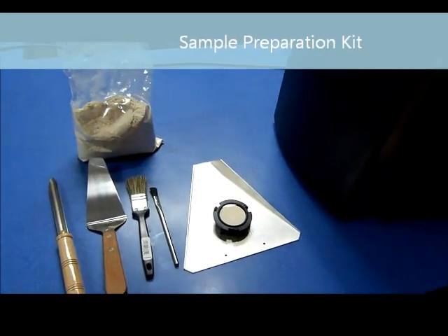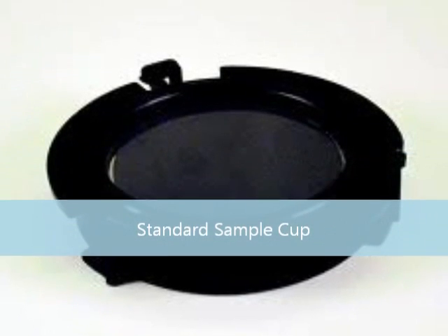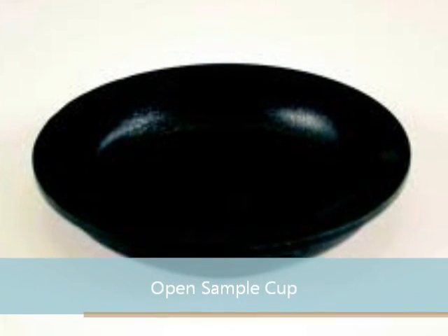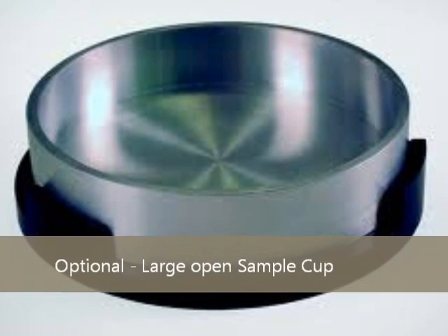Instalab NIR is based on reflectance technology. Advantages are no chemicals, no calculation, and very less sample preparation. The system is equipped with a USB port, LAN port, and RS port.